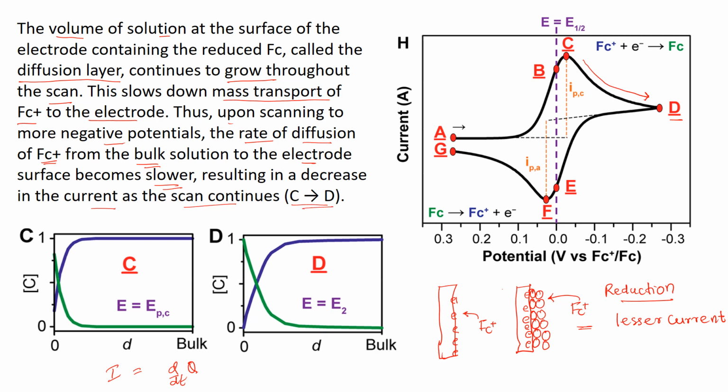So this is the explanation why there is a shape like this. This is called the beak of the duck. So this is a duck shape, and this represents the beak.